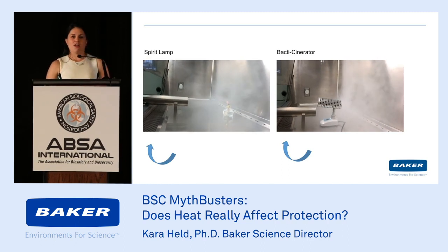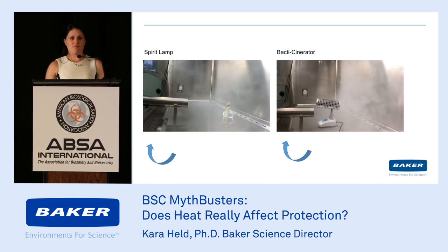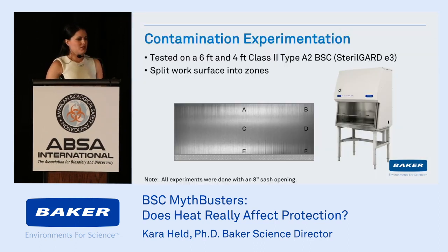So now we're going to move on to a little bit more measurable metrics. So we took a 6-foot and a 4-foot cabinet, both A2 cabinets, and split the work zone into different areas. So if we placed the Bunsen burner in different locations, maybe we would get different results. So we labeled them A through F. All experiments were done with an 8-inch sash opening because that is the most restrictive, and I thought we'd actually give the cabinet a chance. The greater you open the sash opening, the harder the cabinet has to work.